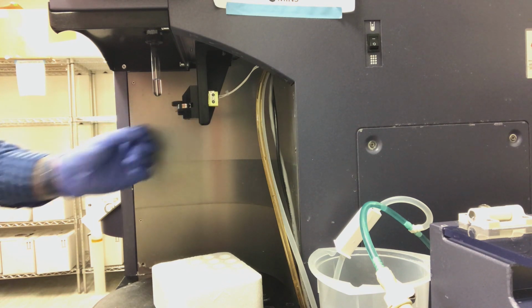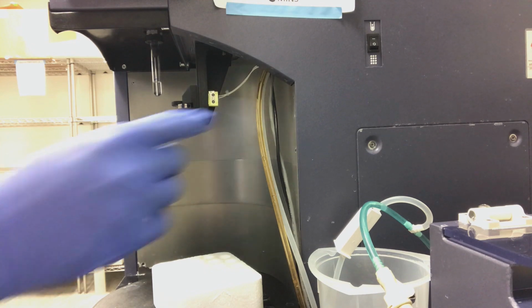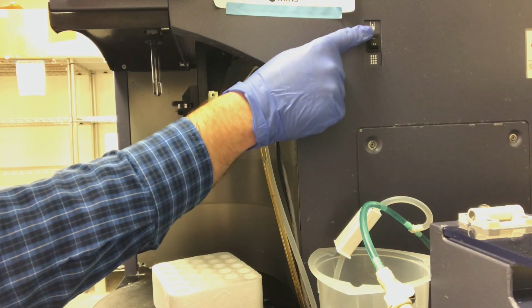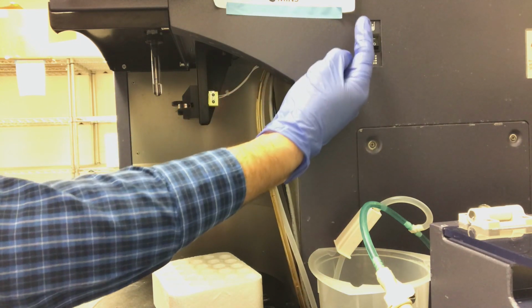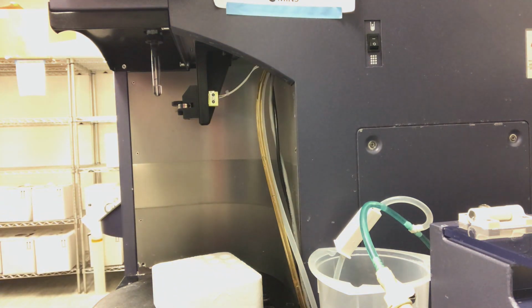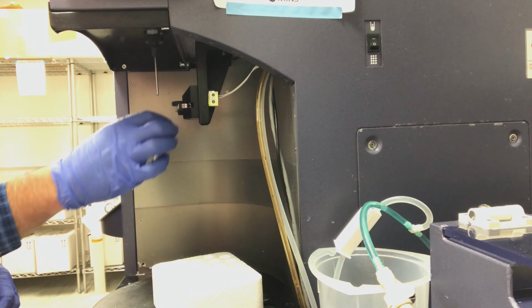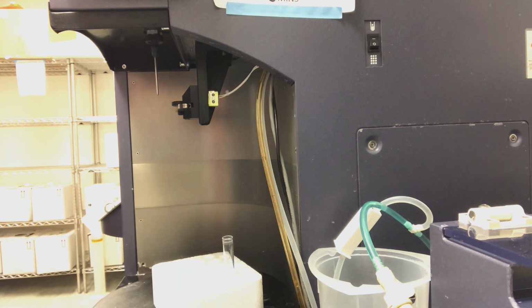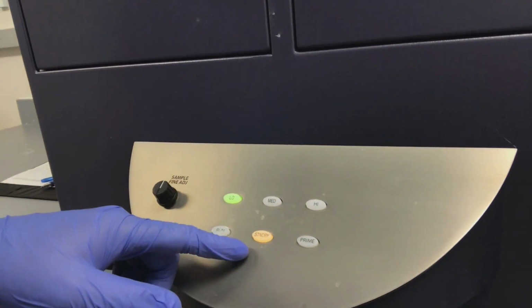So with the arm moved to the side, you can hear an aspirator pump kick on. If you do not hear this, please look here and make sure that the toggle switch is pointed up towards the tube and not down towards the plate. With the arm to the side, we're going to remove our tube, come over to our panel here. It is in standby now.